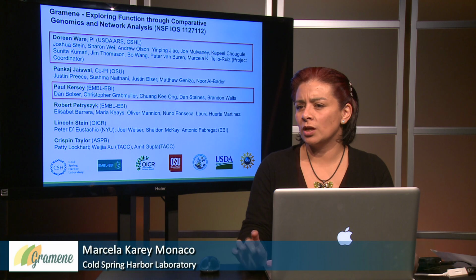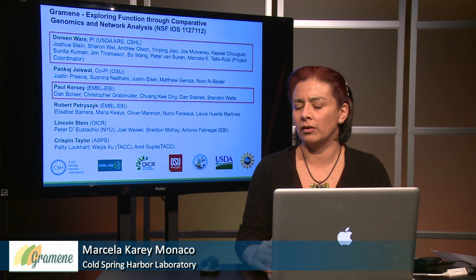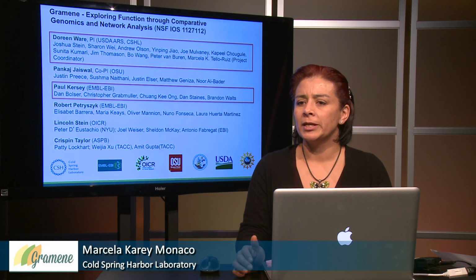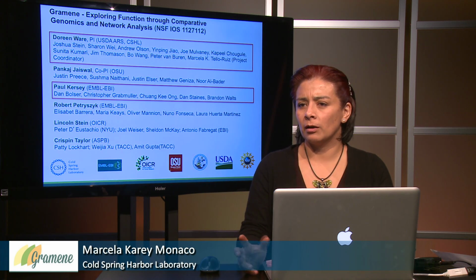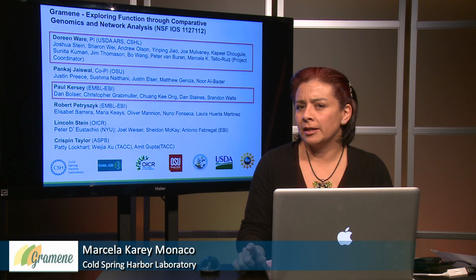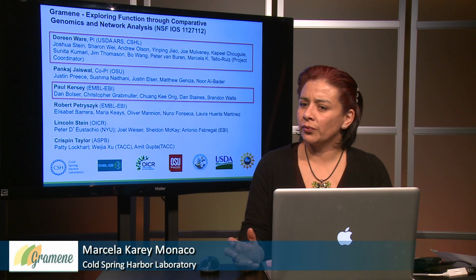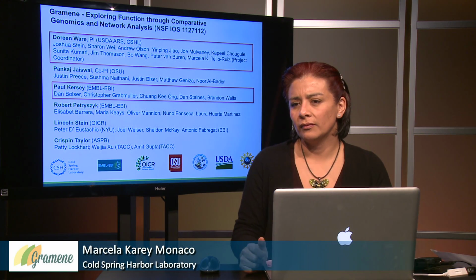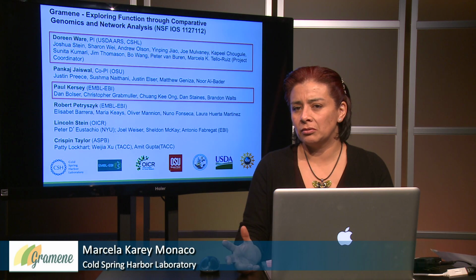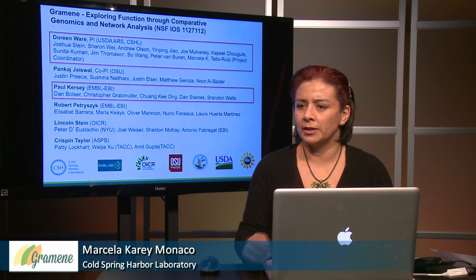This has been touched on in a couple of past webinars that have reviewed the genome browsers. But if you need a little more detail, we can go back. You can explore some of the past genome browser webinars from the Gramene YouTube channel, and that will give you at least a hint of how to get those. There'll be at least a few slides, 2 or 3 slides, but we can discuss in more detail later.